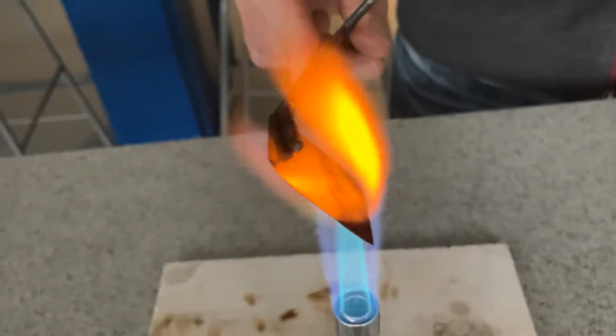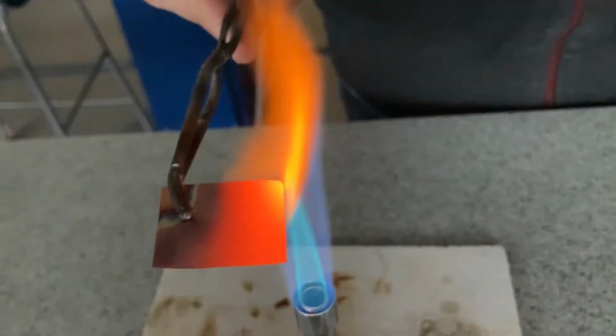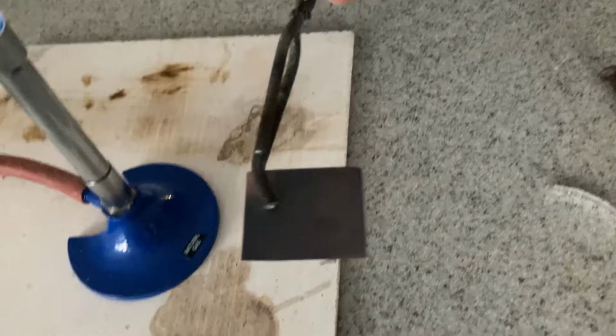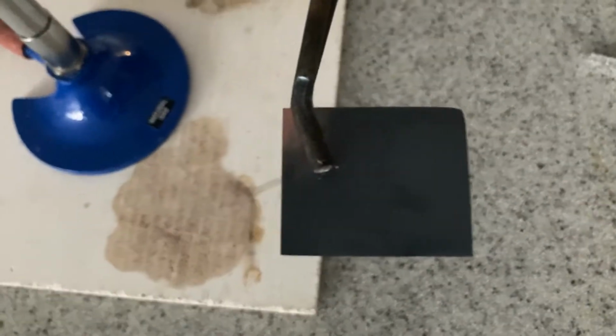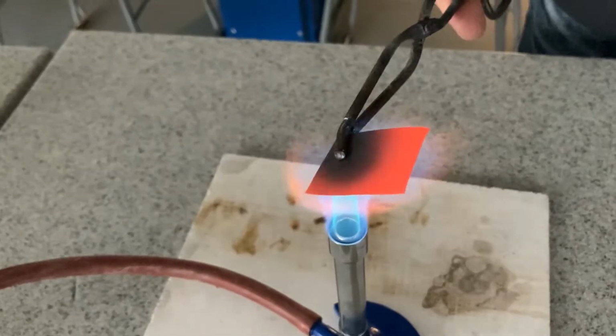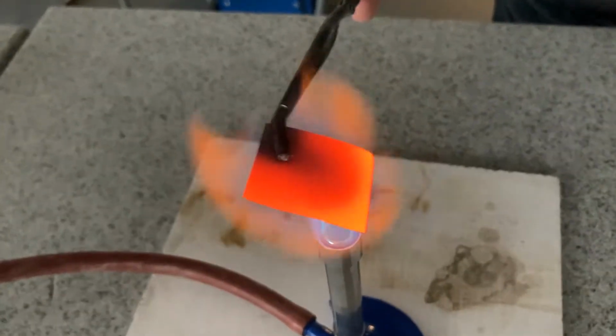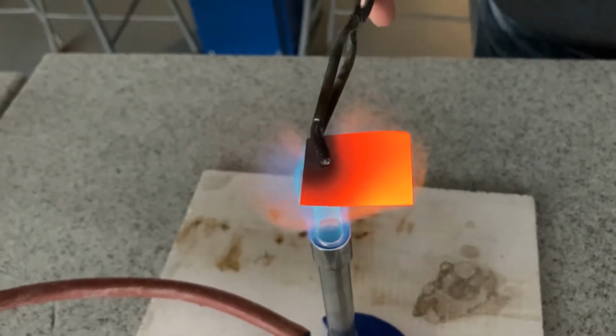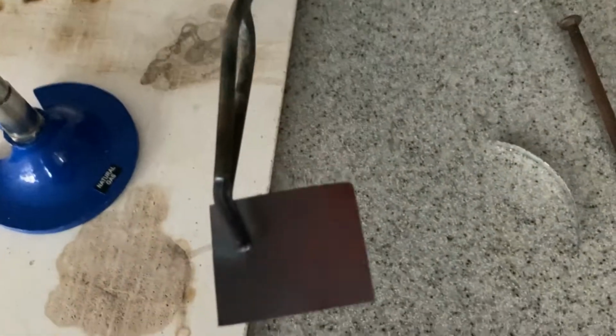Burn it, burn it. I don't know if you can see, it's a glowing red. I'm going to have to take that out. That's definitely darker than it was, isn't it? That's definitely gone darker. Give it a good old heat. And look at that. Well, it's just gone black. So something has happened to it. It has reacted with oxygen, but it's just reacted quite slowly.